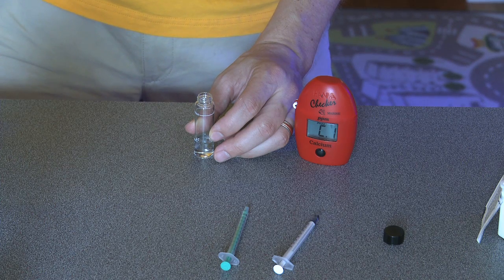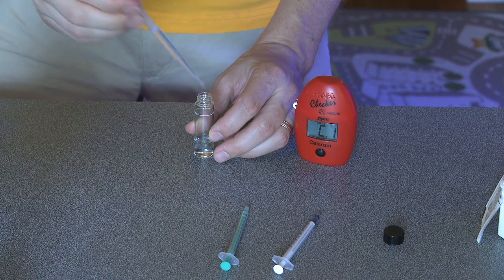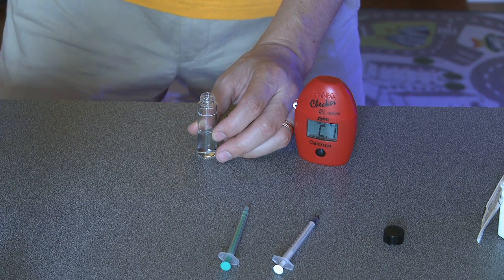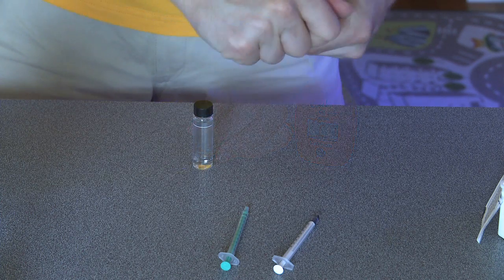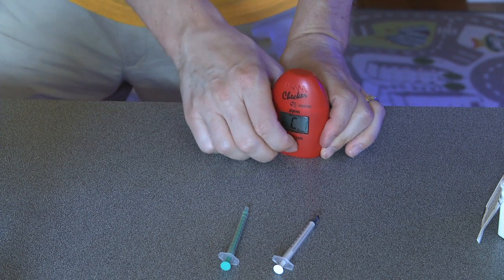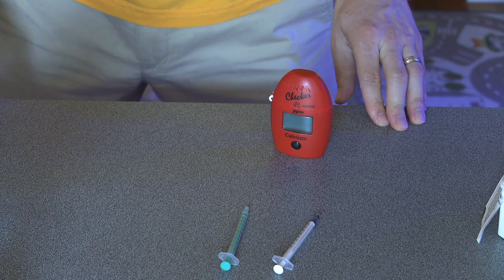You have to use DI water for this test, which is a bonus if you have your own RODI unit. If you don't have your own RODI unit, your local grocery store probably has DI water you can use. Once you've added in the DI water, cap the vial and place it inside the checker, then press the big black button.